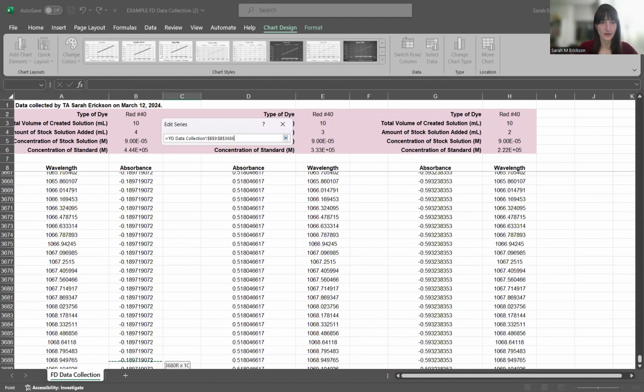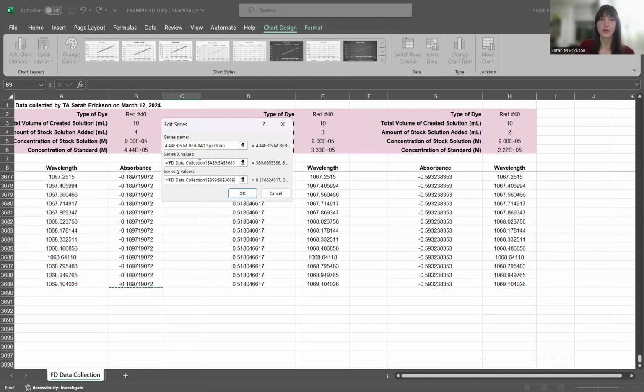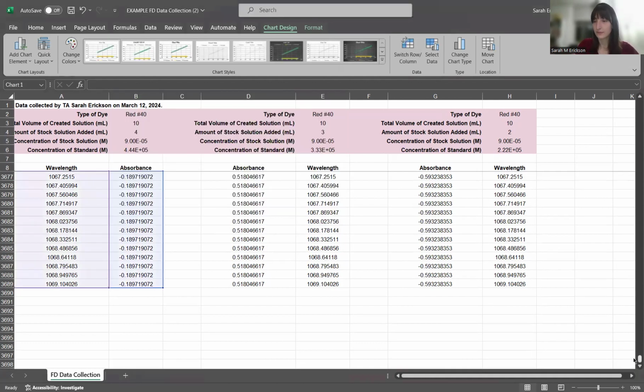You can see it's slowing down now that it's near the end. So I just select those. Okay, so now I have all of my data inputted, and it types all this in when you start selecting things. And I want to hit OK. And then last time I have to scroll all the way back up to the top. Okay, I guess I can't do that right now. I'm going to hit OK a second time.